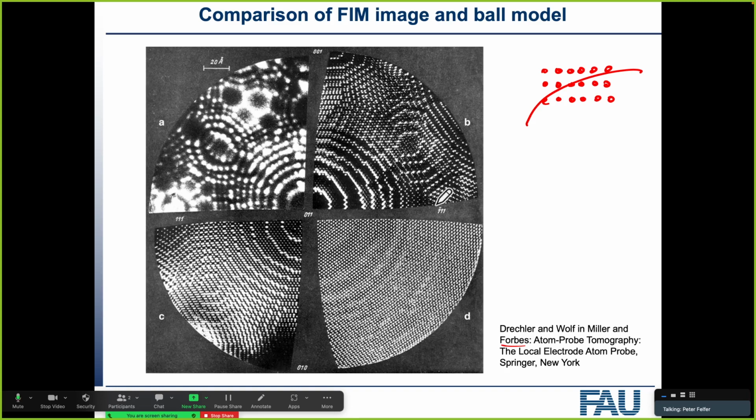So here we can see that it's arranged in different crystallographic directions. And I believe this would be different radii. So you can estimate from the distance between the terraces roughly what the radius of your specimen would be. And of course, from the crystallographic features that appear, you can look at what crystallographic orientation we have. And this is what I meant with, in the beginning, we can do some crystallography. If we see an image like this, we can figure out what the crystallographic orientation is.